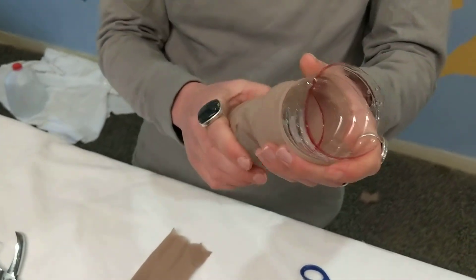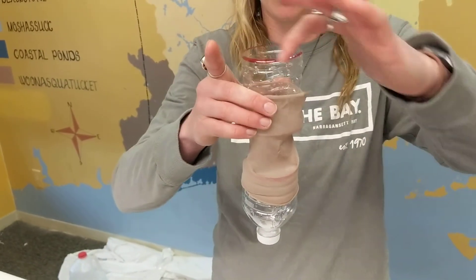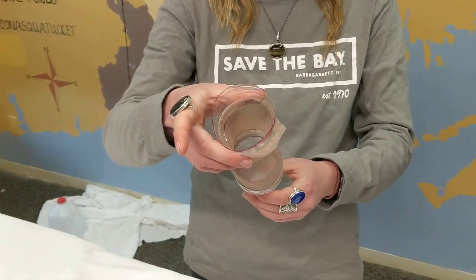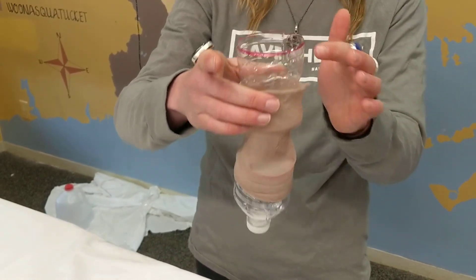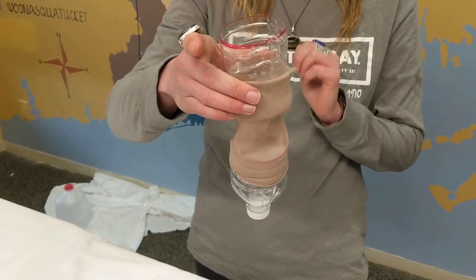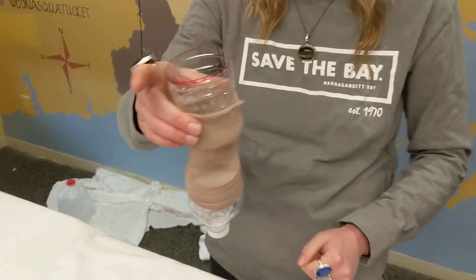Now you can see that it's starting to look a little bit like a plankton net. This part up here is the part that's going to get dragged through the water — that's going to be the mouth that we were talking about. This whole part here is the belly, and then this kind of acts as the cod end at the very end, and that's where your sample is going to be collected.